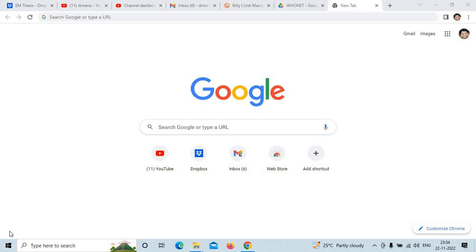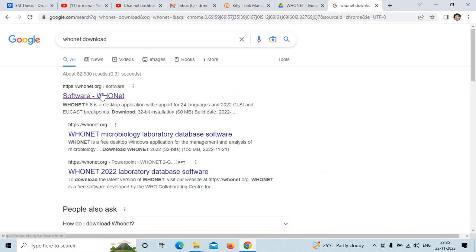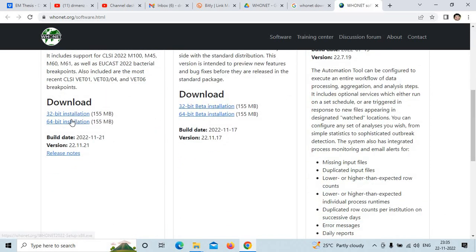Hi everyone, in this video I'm gonna show how to install WHONET from scratch and add those customized configuration files along with the code files into your newly installed WHONET. So first, to start with, we search for WHONET download in Google, which will take us straight away to the landing page of the WHONET software, and we proceed with downloading the latest one, the 64-bit installation file.